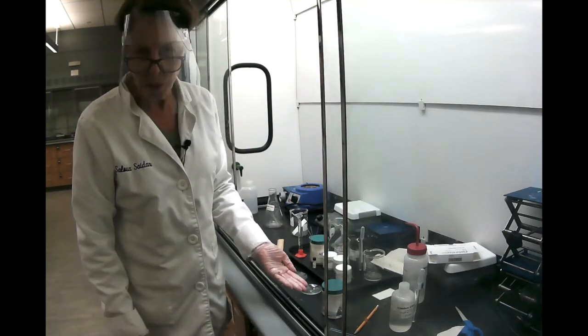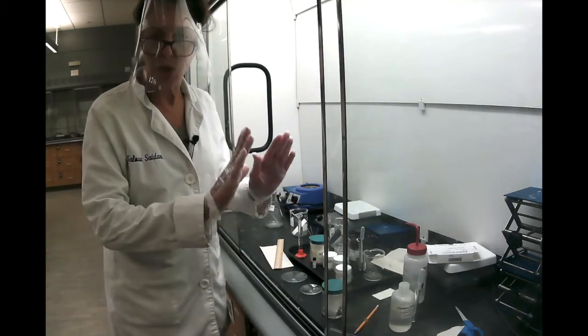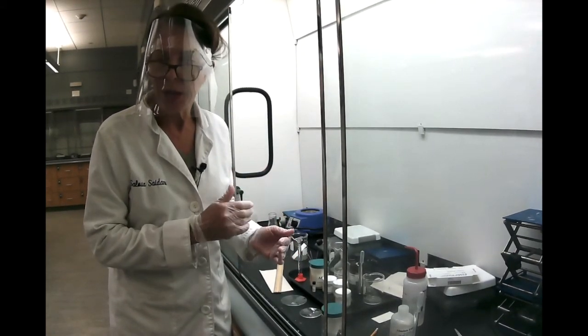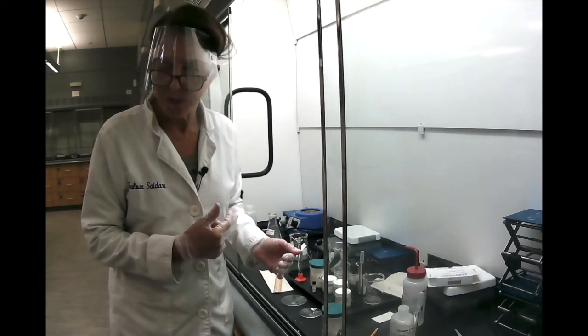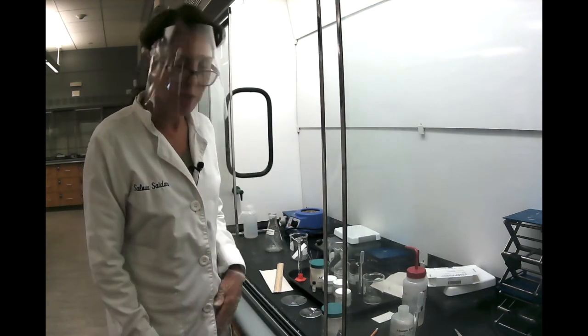And now at this point, you start to see that the liquid is moving up, and on its way up, it's pushing with it these substances. And of course, they're not going to all move at the same rate, and later we're going to measure at what rate each one of these moves to identify our substance.